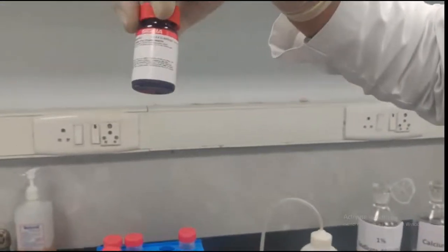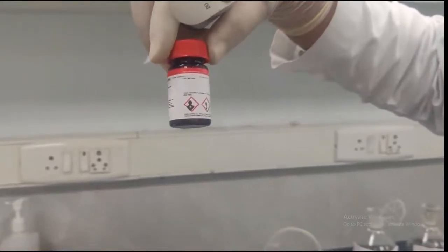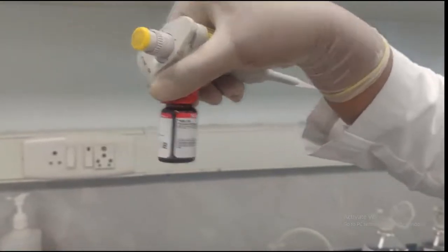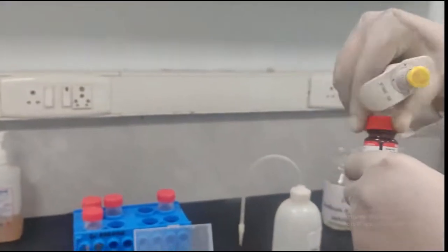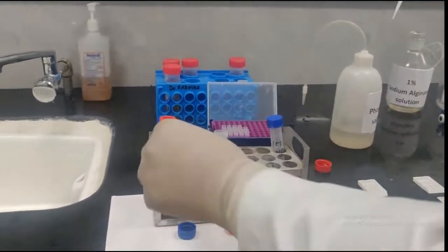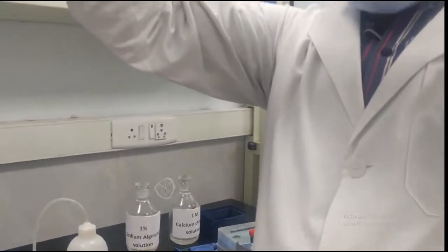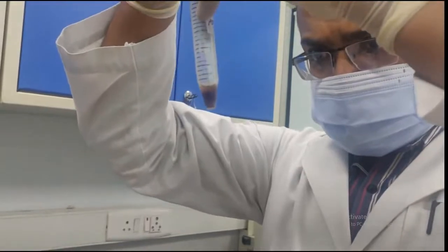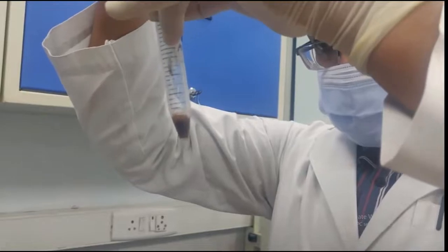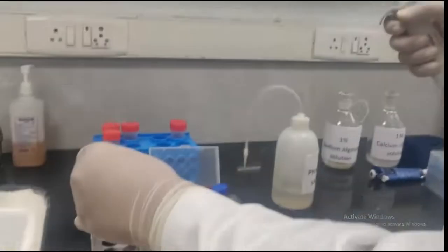So this is the thrombin vial. Initially this thrombin originally comes as a lyophilized powder, and we reconstitute it using 8 ml of distilled water, and now 50 microliter of this thrombin solution will be added to each of these tubes. We have to go down and then add thrombin so that plasma and thrombin come in contact with each other and a clot will form within a few seconds.